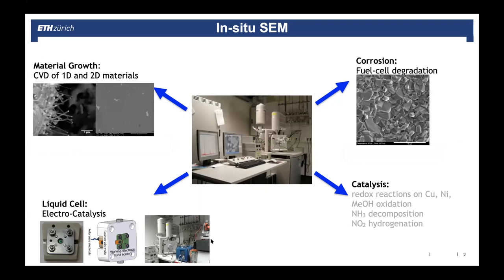When you think about in-situ electron microscopy, most people at conferences talk about in-situ transmission electron microscopy. I mean, these are huge, very expensive instruments where you can do things at very high resolution. And people often forget that the simple scanning electron microscope is actually a very nice in-situ platform, if you want to do in-situ electron microscopy.